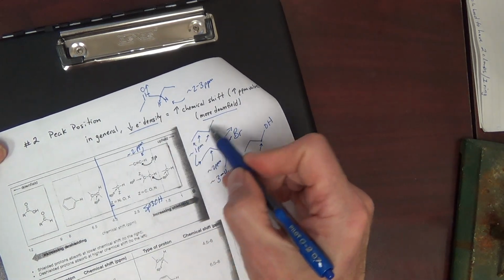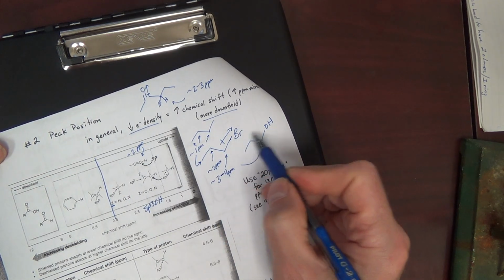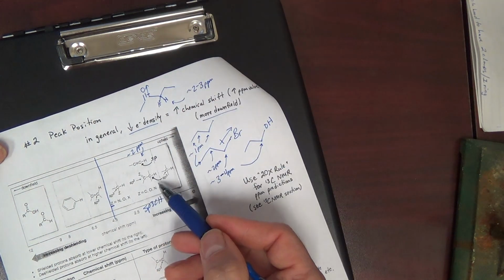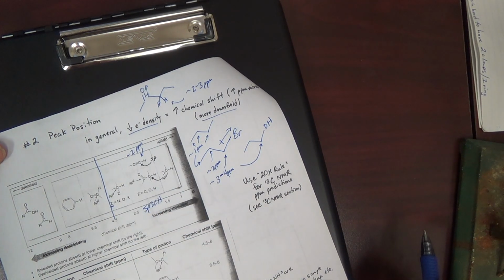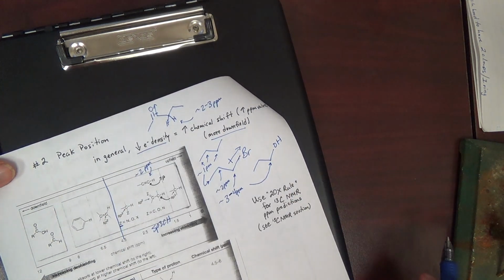Basically, a standard alkane CH is about 1 ppm, but if you have an electron withdrawing group nearby, like a halogen or an OH or maybe an NH2, it's going to move the signal downfield to more like about 3 to 4 ppm. A carbonyl is more like about 2 ppm.